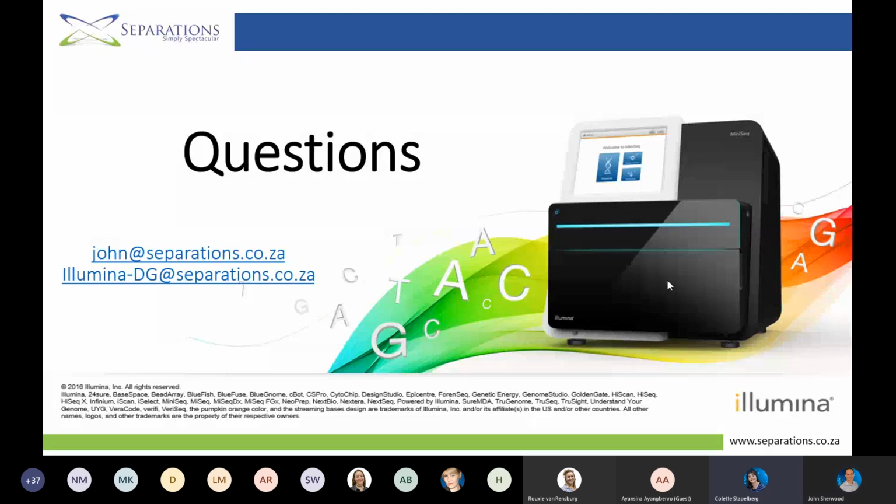So John, Peggy just says here we would like to use it for microbiome studies moving forward. That's excellent. So 16S, that would be great. It's an excellent assay, an excellent technology, and an excellent discipline that you want to use on your MiniSeq. If you need any further info, or would like to talk about any library preps or analyses with regards to the microbiomes that you are investigating, you are welcome to contact us, and we'll be very happy to share some info with you. No further questions, John. Great stuff.